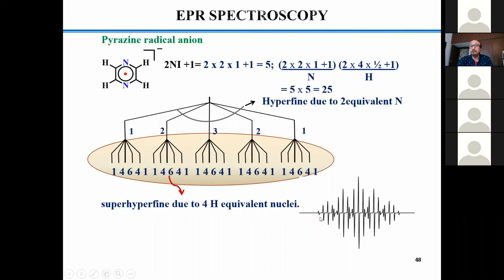Now, if you look at the intensity, there is a beautiful pattern where it grows and then starts decreasing. Why? Because this is the distribution for the protons, you need to multiply this by this, 2 by this, 3 by this. So you will reach a maximum of 18 here, here 12, here 6.